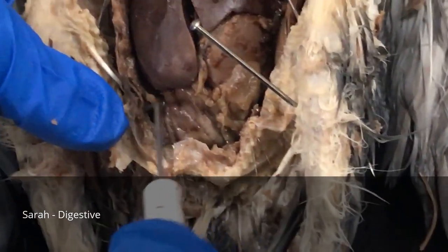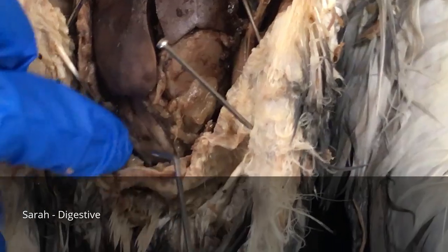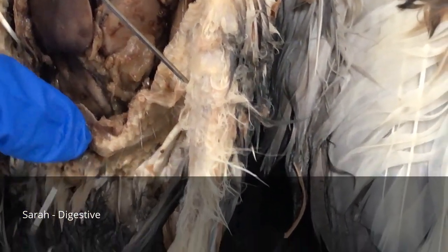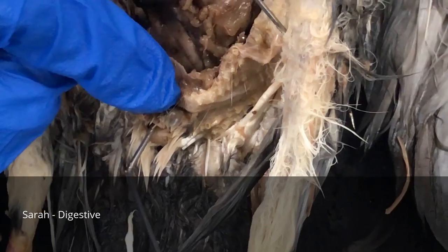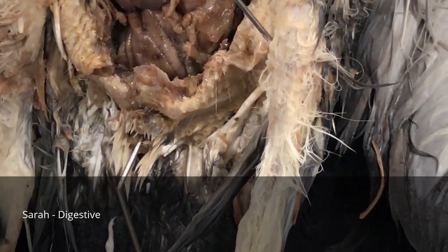That's where the nutrients are absorbed, and then it goes through the rectum, and the rectum is located here inside the cloaca. The cloaca is basically a shared hole for the excretory system, the digestive system, and the reproductive system. So it all comes out of this shared hole here.